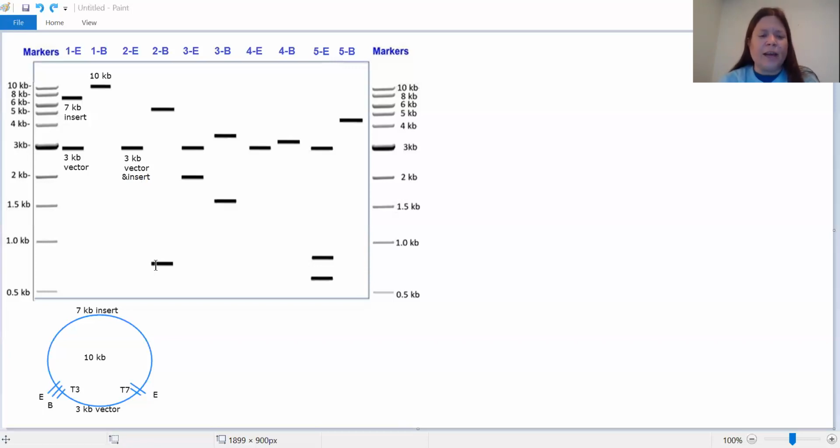So now, looking at the BamH1 lane, we pick a size for this band. I think 0.7 kb looks like a good number for it. You might have picked a number that's slightly different. You might say 0.8. That's also perfectly fine. And then we know our total plasmid size is 6 kb. This band is a little above 5. So to get this to add to 6, we'd say, oh, this one must be 5.3 kb.